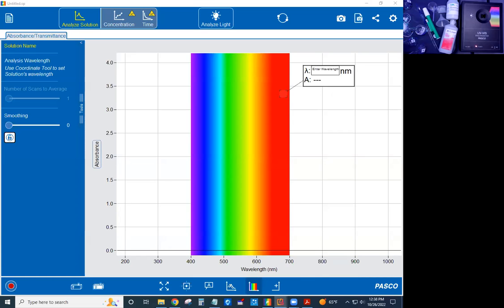And in the background, you can see spectrometry. I'm going to show you how to check to make sure that you have the correct version of spectrometry before we move on. So I've downloaded the spectrometry software. I've already connected the spectrometer by USB to my computer. I just plugged it in, and this shows that I'm connected.